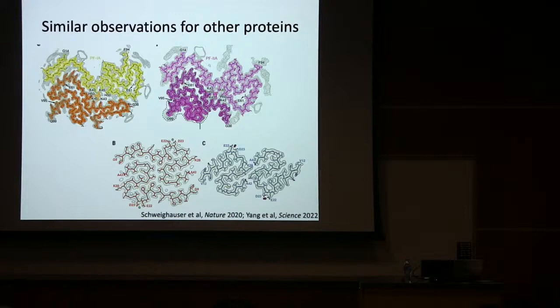So for alpha-synuclein, we looked at 5 different cases of multiple system atrophy, MSA, and their structures, and we saw there are 2 different types of filaments in MSA as well. Some individuals only have one and some have only the other, and in some it's a mixture, but MSA is characterized by these types of structures of alpha-synuclein. When we try to do the same with dementia with Lewy bodies, which has alpha-synuclein filaments as well, we saw the filaments were mostly untwisted and probably different from the MSA, although that still needs to be confirmed because we've never been able to solve the structures.